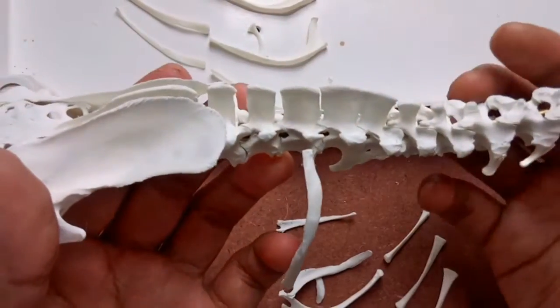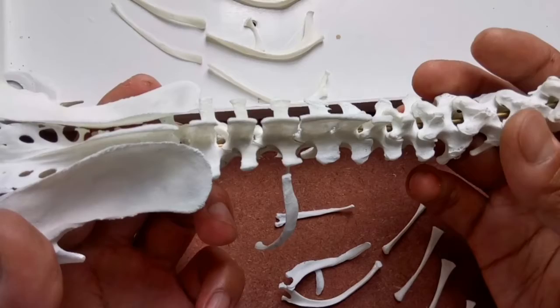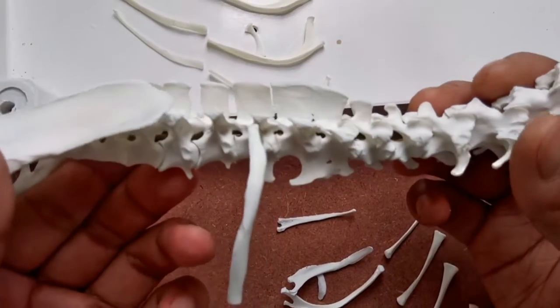Begin articulating the ribs in the way that we have explained. Start with articulating the seven thoracic ribs.